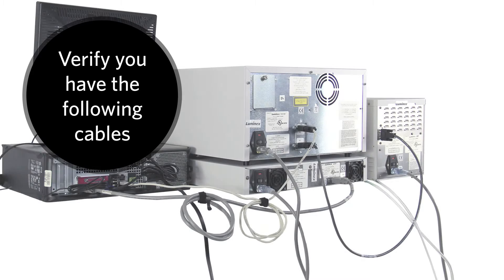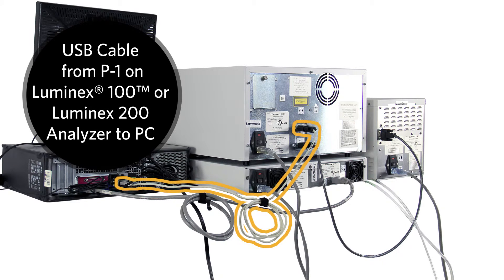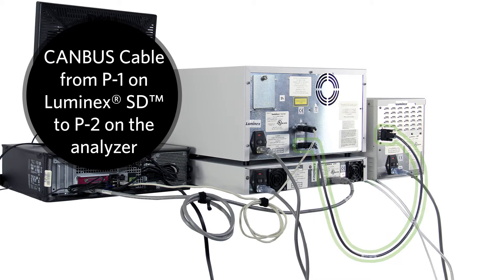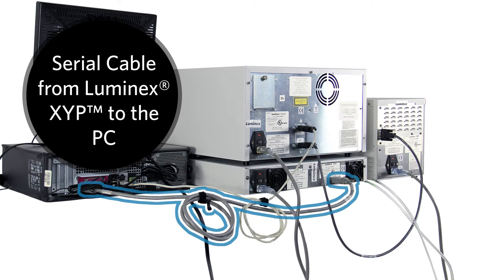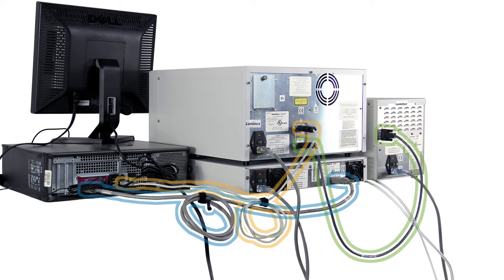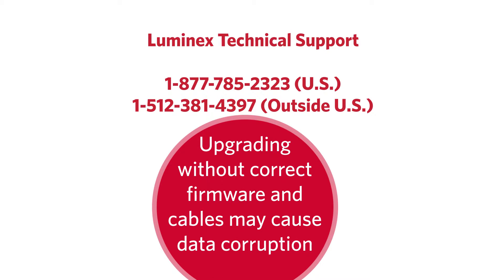Before we start the upgrade process, verify that the following cables are in place on your system: a USB cable from P1 on the Luminex 100 or 200 analyzer to a USB port on the PC, a CANBUS cable from P1 on the Luminex SD to P2 on the analyzer, and a serial cable from the Luminex XYP to the PC. Please note, if you do not have these cables connected, you may need a firmware update and should contact Luminex technical support. Continuing the upgrade without the proper firmware and cables may cause data corruption.